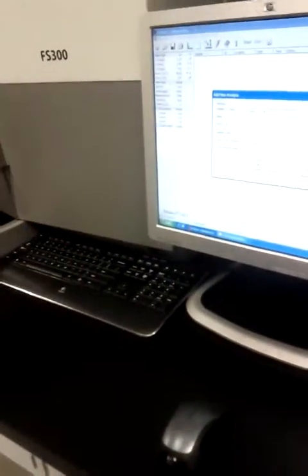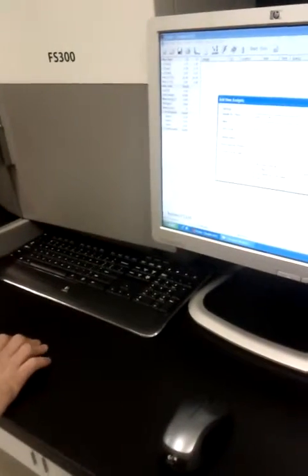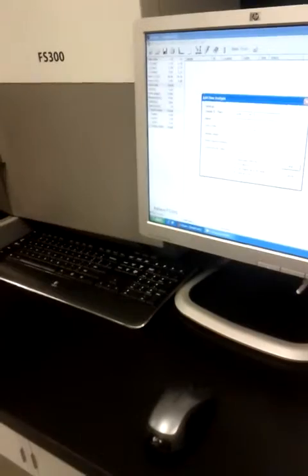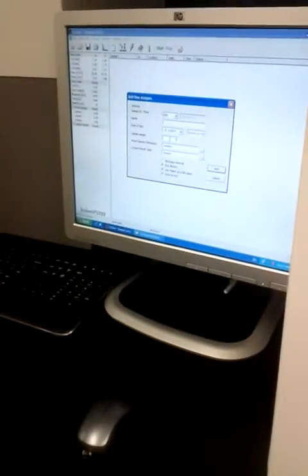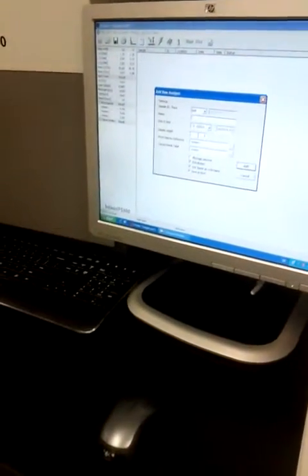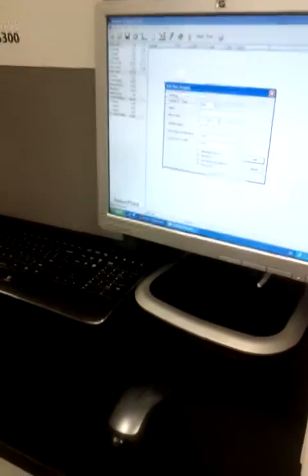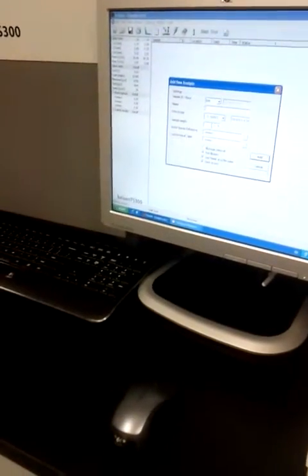But if you're not interested in analyzing the coarseness, you don't have to do that. You just put 0. And what do you mean by coarseness? Coarseness is the weight of the sample divided by its length. It tells you how the weight of your fibers or sample is distributed along its length.